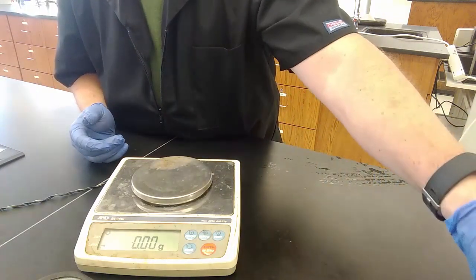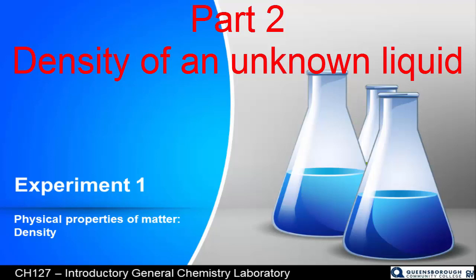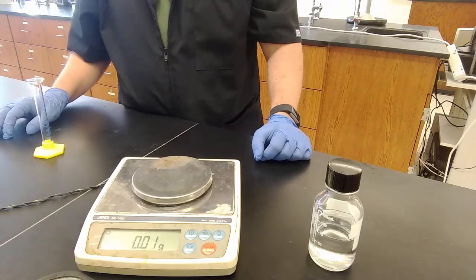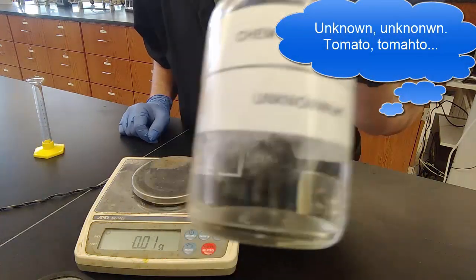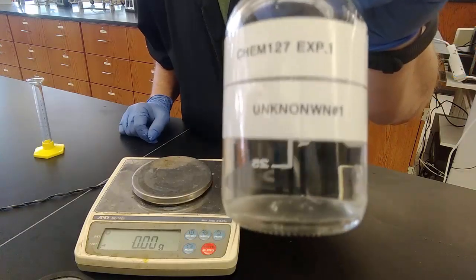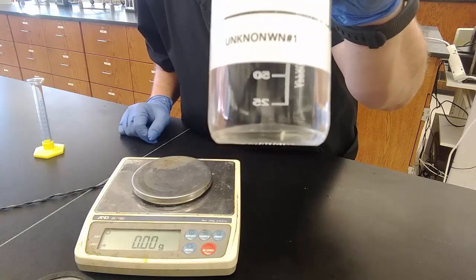So there we go. That was part 1, identifying an unknown solid based on its density. Let's move on to part 2, determining the density of an unknown liquid. And that's exactly what I have here, unknown liquid, right? It's liquid number 1 if you're keeping score at home, and you do need to keep score because the unknown number is line 2A. Obtain an unknown liquid, record its number on the data sheet.